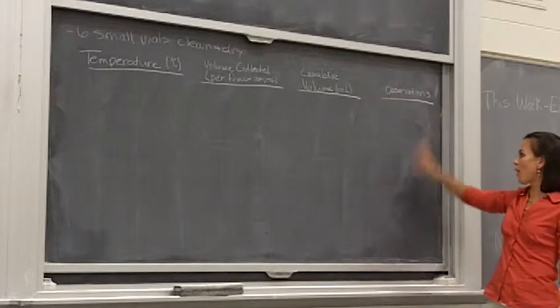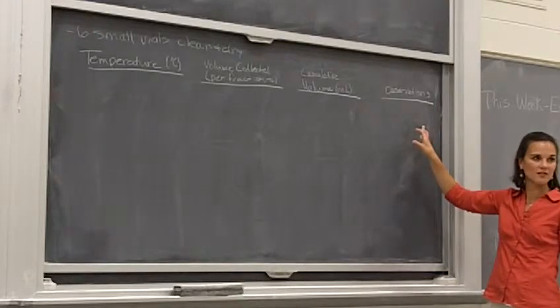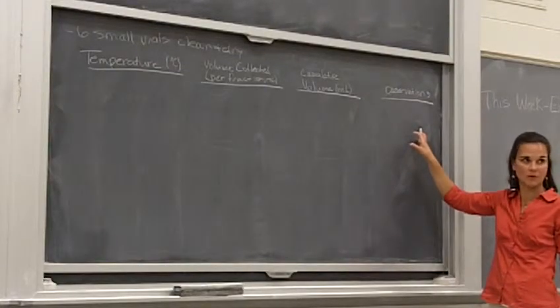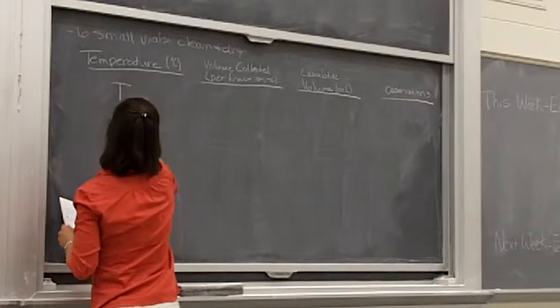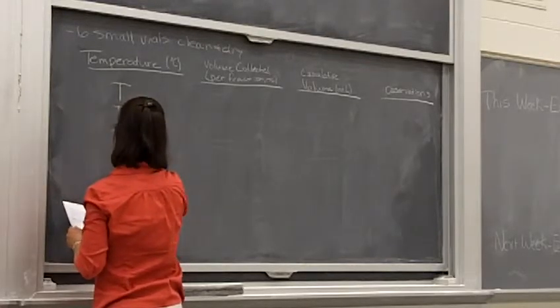Because you are also graded on this column. And you can't do a fractional distillation and not have any observations at the end. There should have been observations made, okay? So don't neglect that column. So for this distillation, say we're collecting temperatures here, we're going at least every half milliliter.